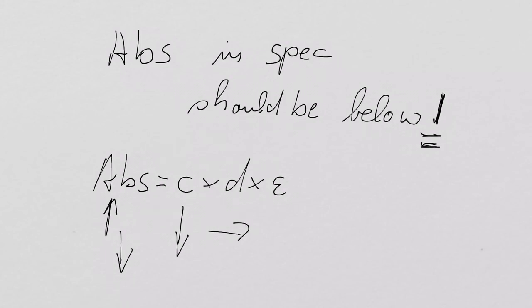So you should be able to do the quiz on spectrophotometry. You can actually use spectrophotometry to do a lot of fancy things. For example, you can identify compounds with spectrophotometry. But we don't talk about that. That is something that one of my colleagues will discuss with you later on.